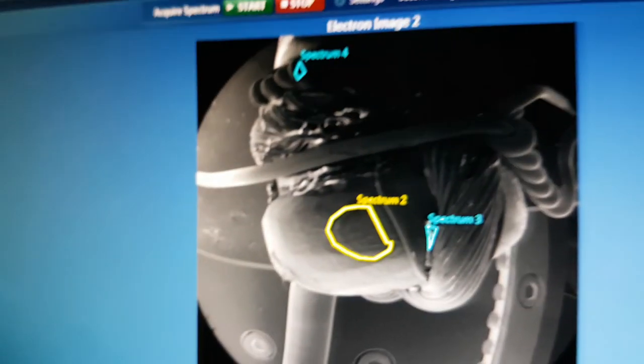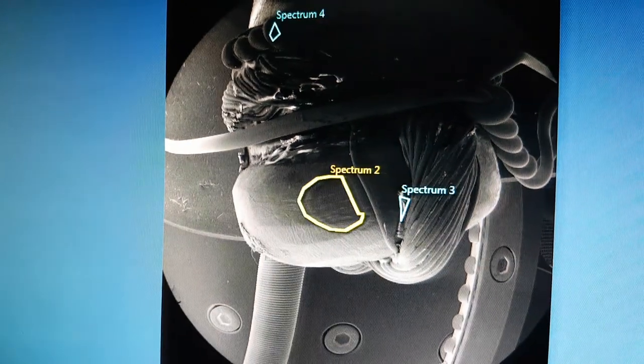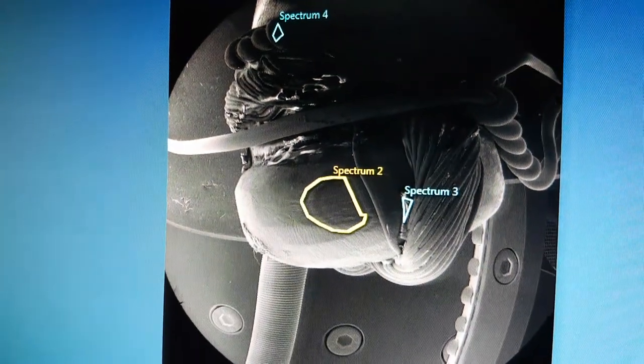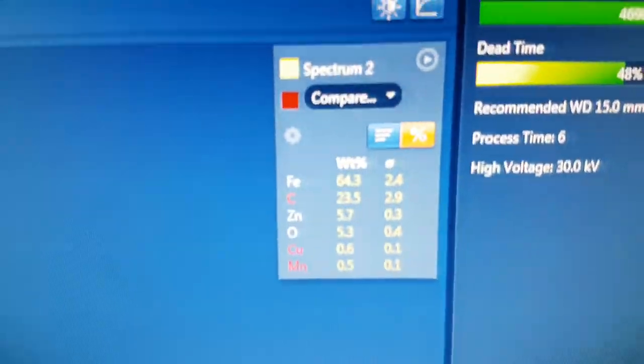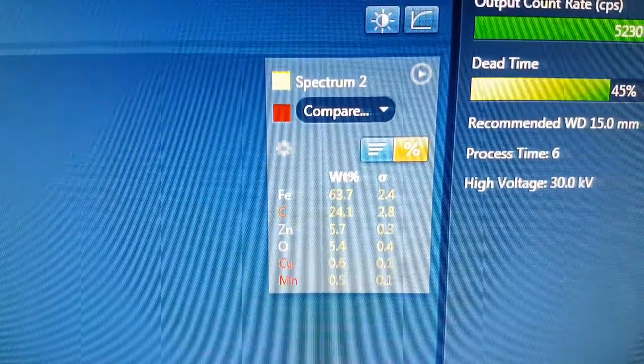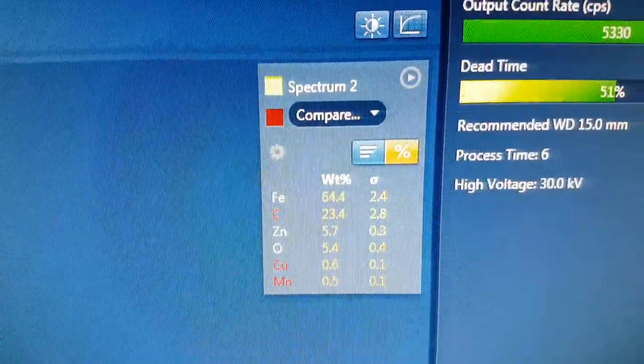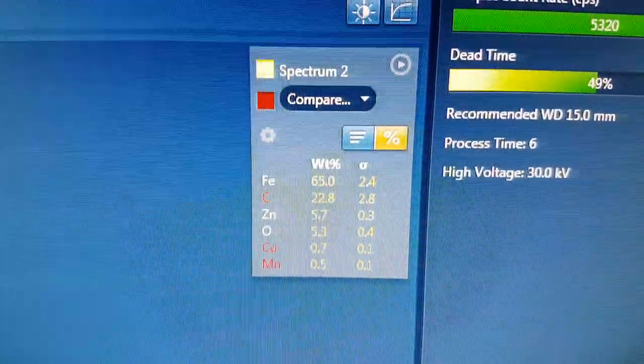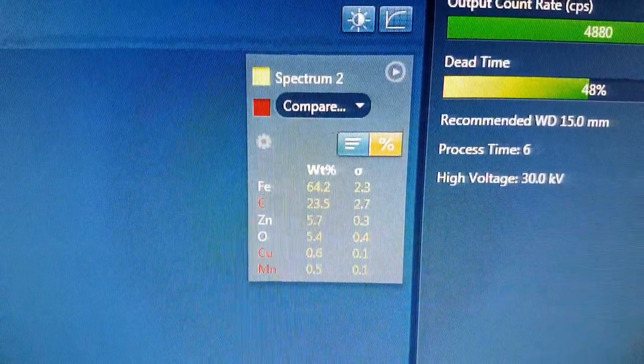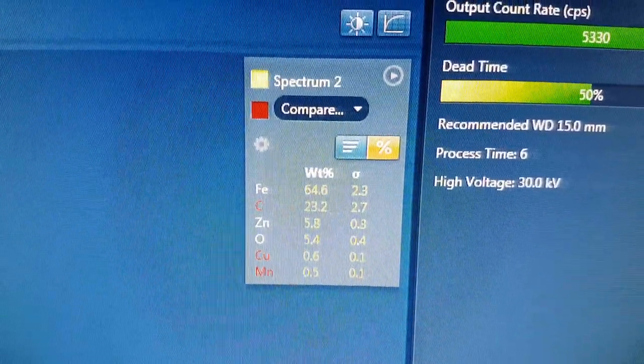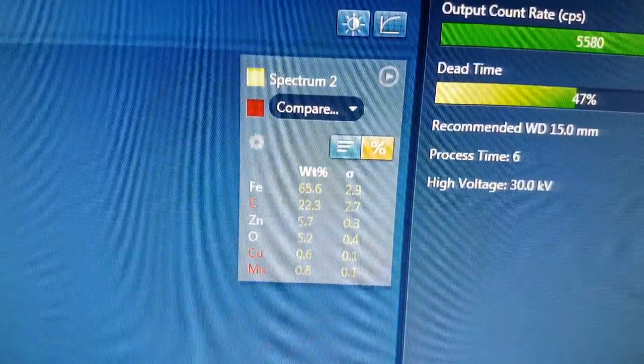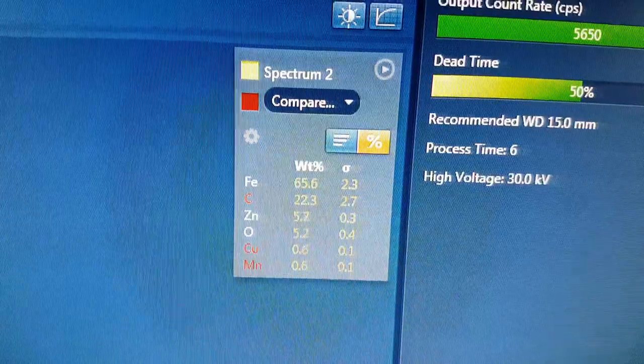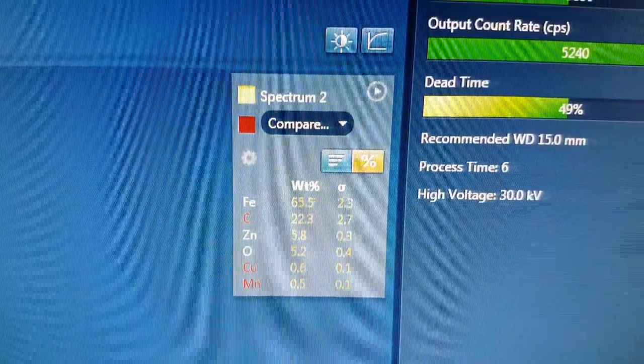So the Spectrum 2 here, which is on the head of the bolt, you're seeing quite a lot of zinc on the surface.